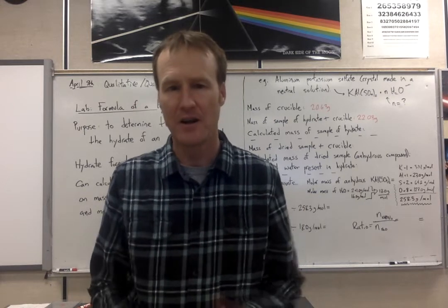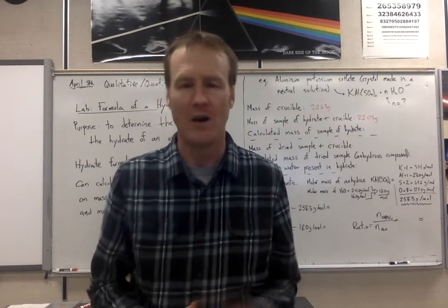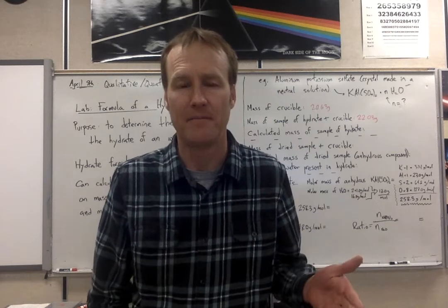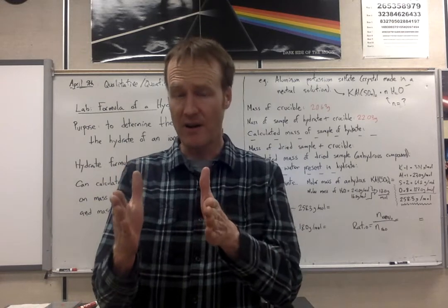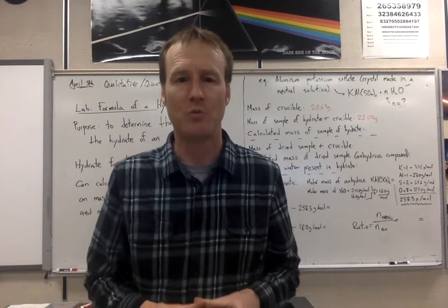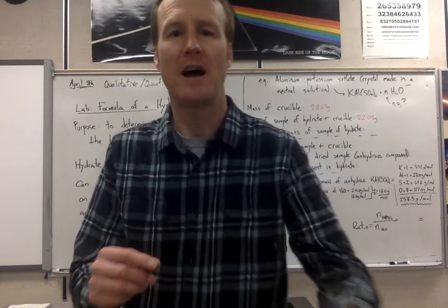Just a reminder, hydrate is a special kind of ionic compound. A lot of ionic compounds like salt, sodium chloride, is just sodium and chlorine, the chloride ion. Now, a hydrate is a regular ionic compound, but locked into the crystal structure are molecules of water. And they show that using a little dot after the formula. Let me show you what that looks like.